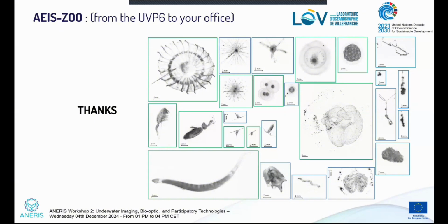Basically, the UV light is used to prevent biofouling from settling on the protected zones, I mean, the zones that are illuminated by the UV light. The way it works is that it kills the DNA of the bacteria that first settle on the glass, on the optics, and that allow the installation of the higher organisms, more evolved organisms like algae or some zoo organisms.